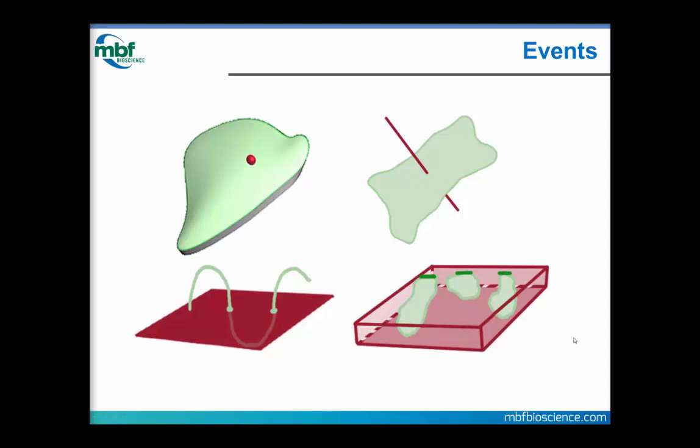This in red is the virtual geometrical shape. It has to be a three-dimensional system because we need to find the leading edge of the particles. We could also call that the top of the cell. So we'll have a three-dimensional space, which is a cube or a three-dimensional rectangle, and that is called a dissector.